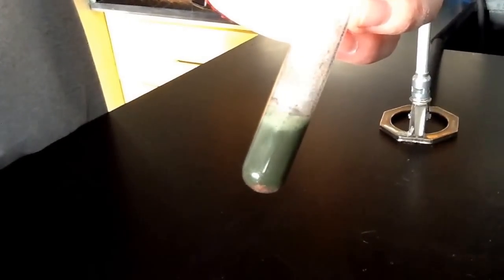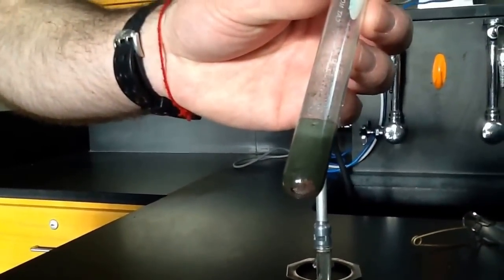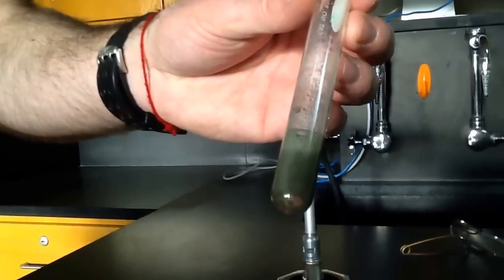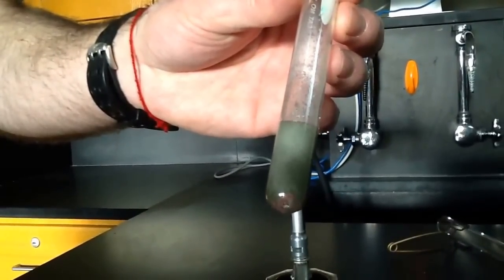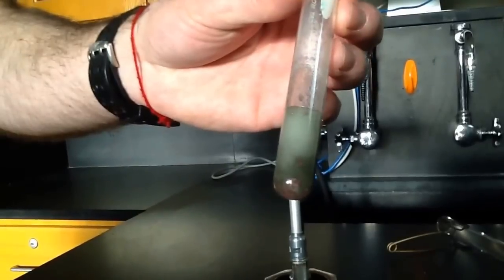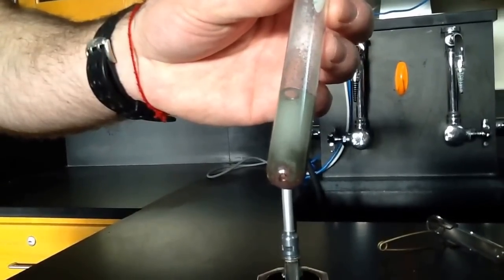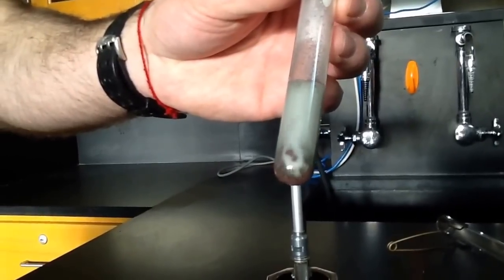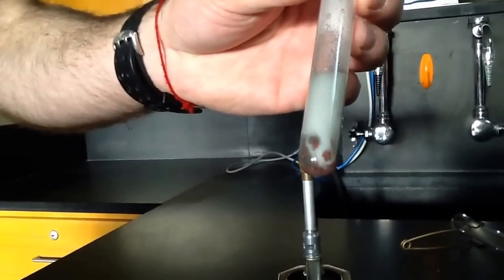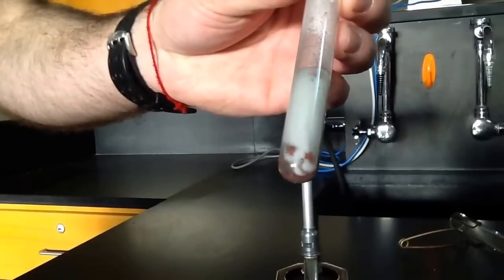All right, so we see a really vigorous reaction with the aluminum and the copper chloride. And how you recognize that this is a single replacement reaction is that when you're reacting an element with a compound, that's going to be a single replacement reaction. Another way to think about it is if you have something that's single on either side of your reaction, then you know that it's going to be a single replacement reaction.